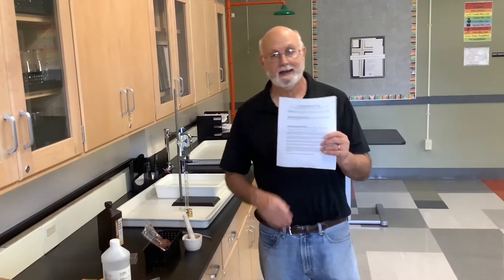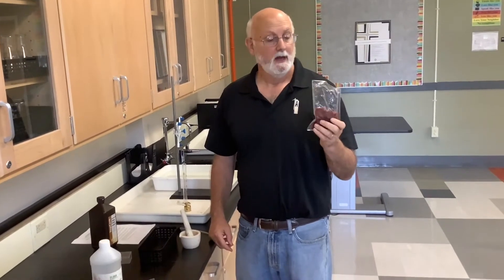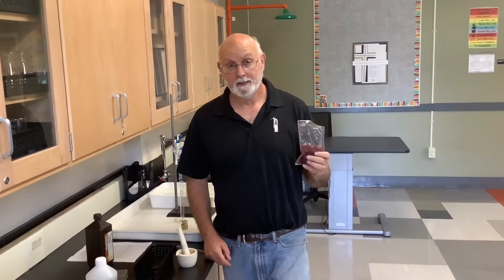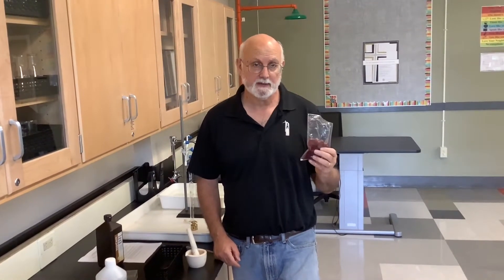Ladies and gentlemen, we are doing the Catalase Enzyme Activity Lab. What we're going to be doing is we're going to be taking liver. Liver itself is a really all-purpose organ — without a doubt the second most important organ of the body besides the brain. It controls upwards of about 1,000 different chemical reactions in your body, and so it's filled with tons and tons of enzymes.